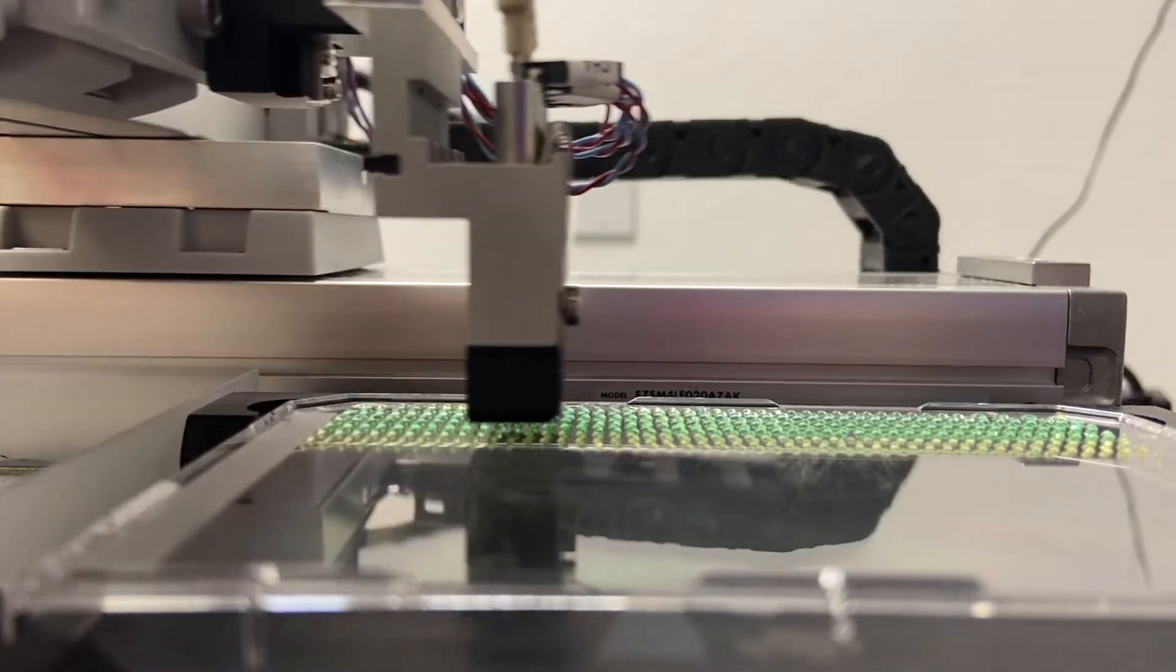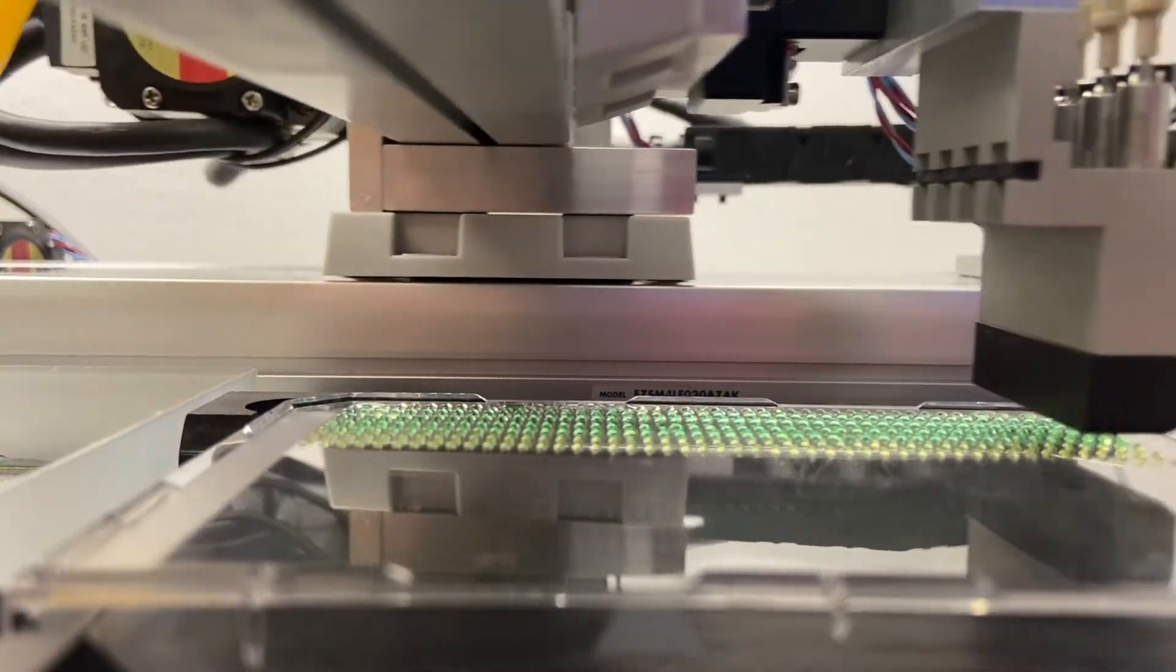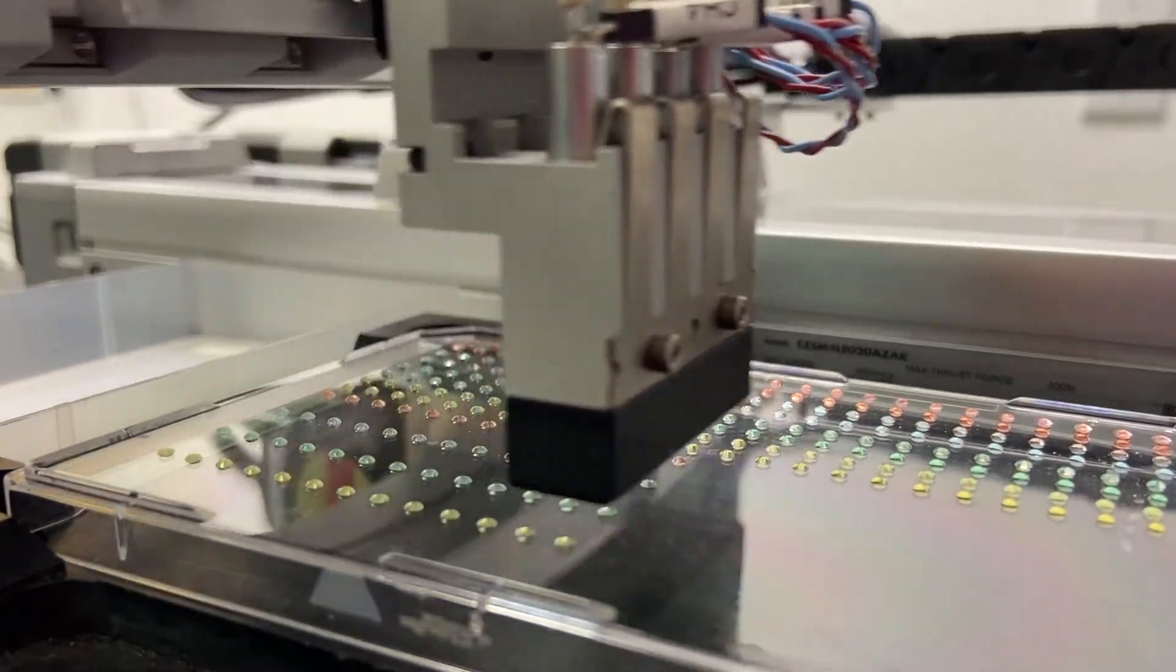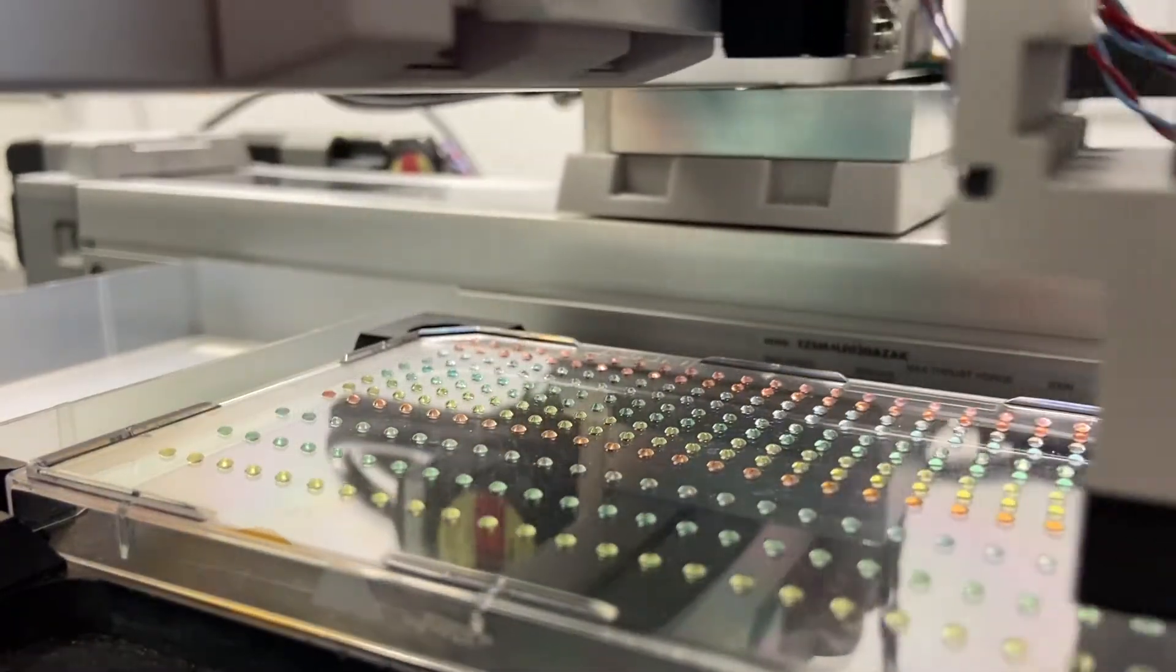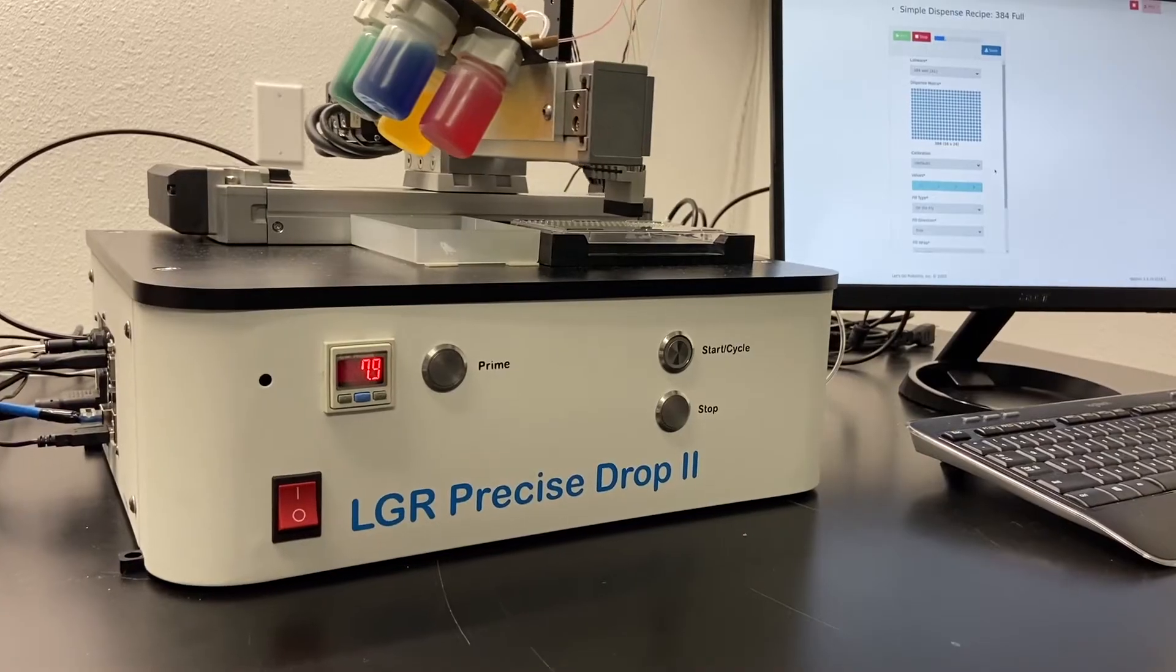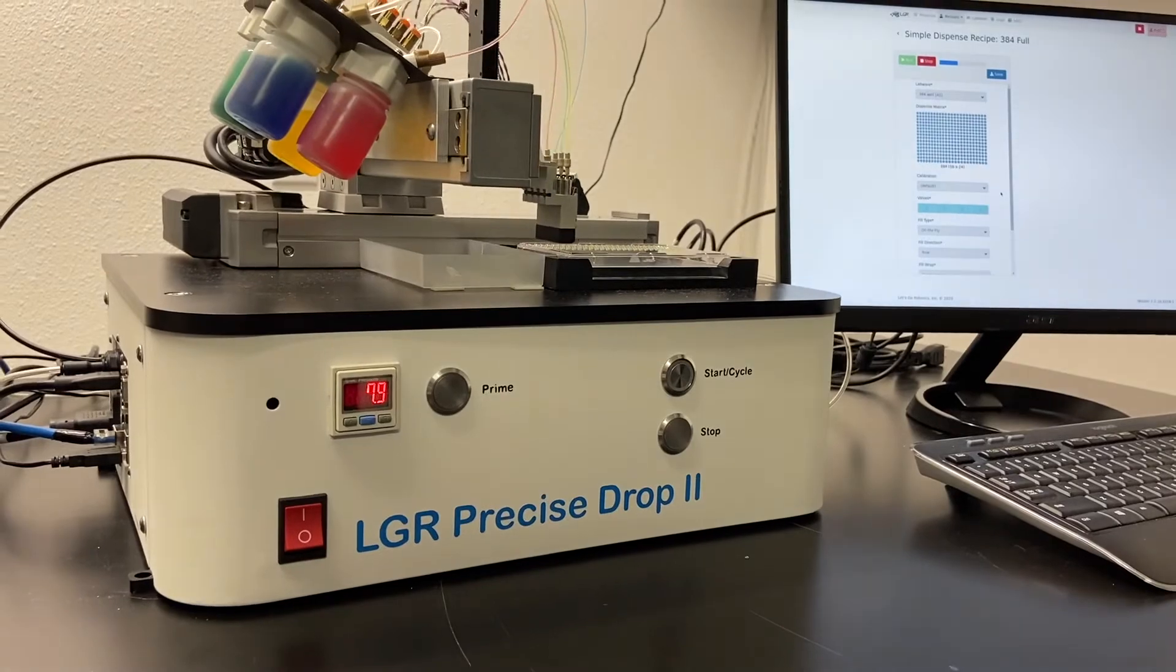The system is automation robotic friendly with new features currently in development. The software runs on a Linux box computer with a user-friendly web interface.